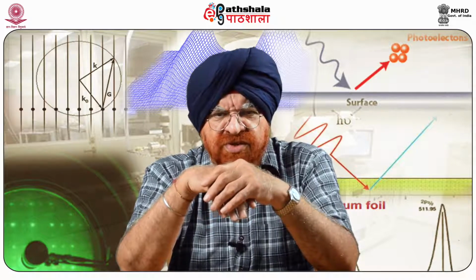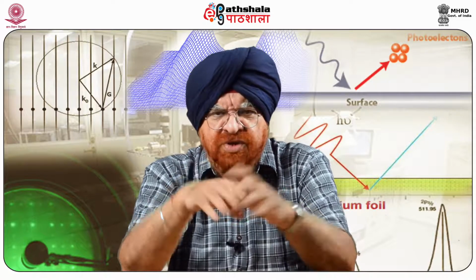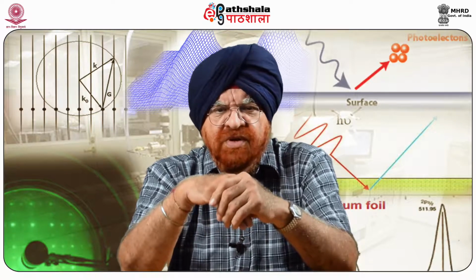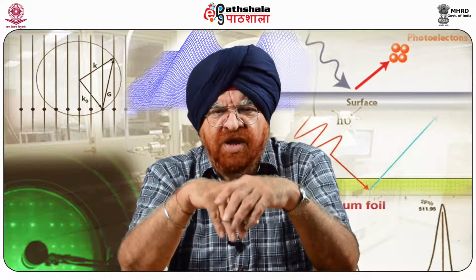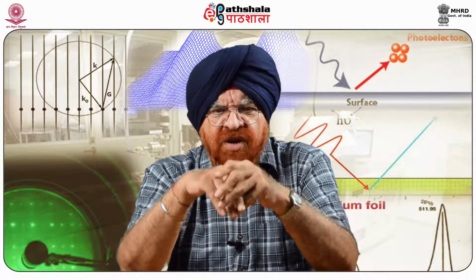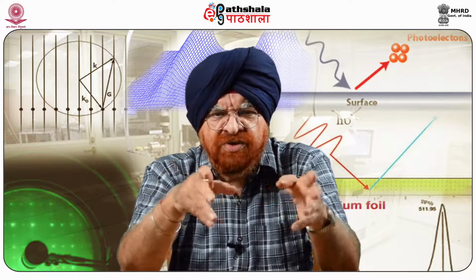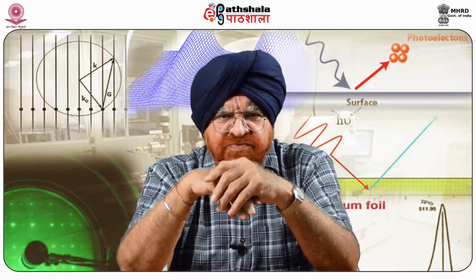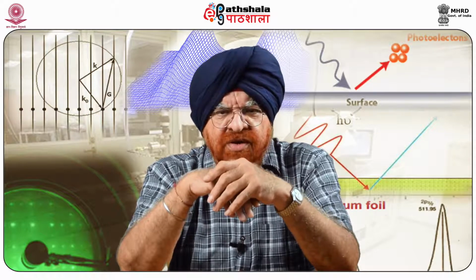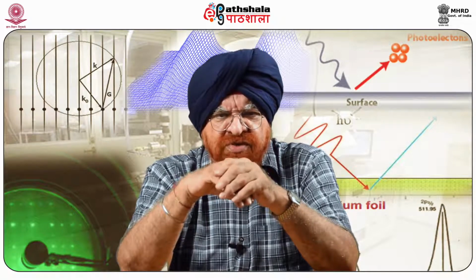That is, the extra force comes from the attraction of liquid molecules to each other. This is 10 pN for ethyl alcohol, which still allows for the observation of even the weakest polar-nonpolar interaction, approximately 20 pN. The choice of liquid is dependent on which interactions are of interest.